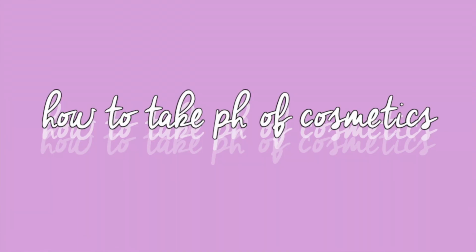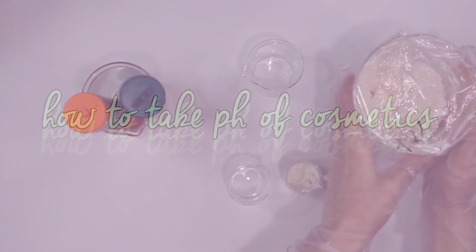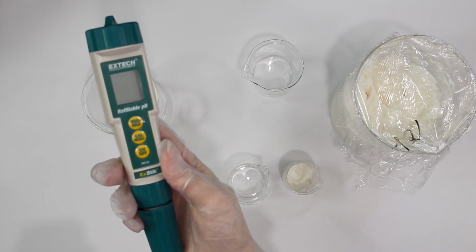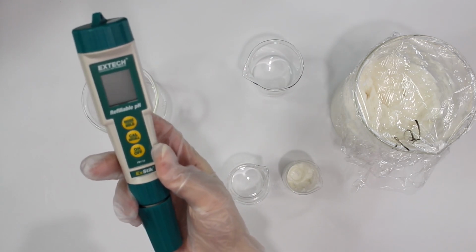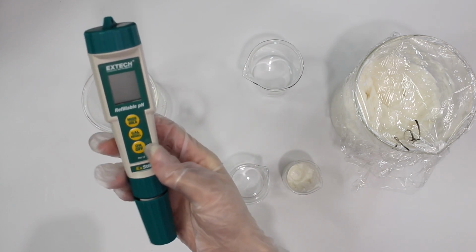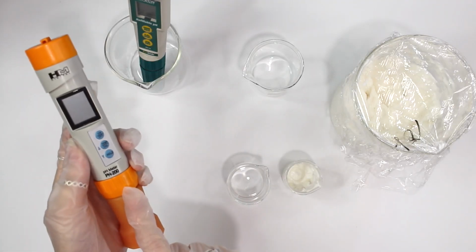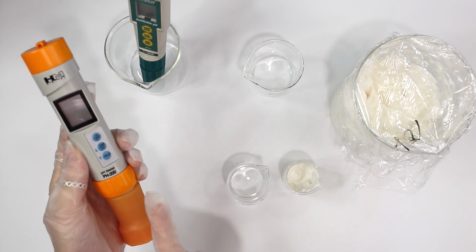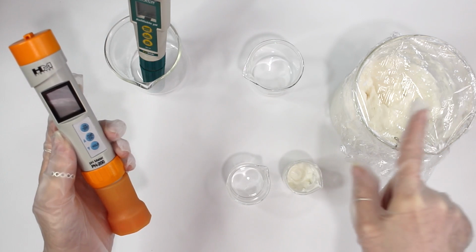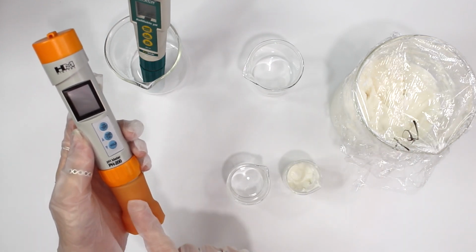So now I want to show you guys how to actually take the pH, and specifically we're going to be taking the pH of a moisturizer. So like I said, this new pH meter here that I just unboxed, this can actually take the pH of thick creams without them being diluted. As opposed to my older pH meter, this actually can only take the pH of liquidy solutions. So you actually need to dilute down the cream in order to take the pH.